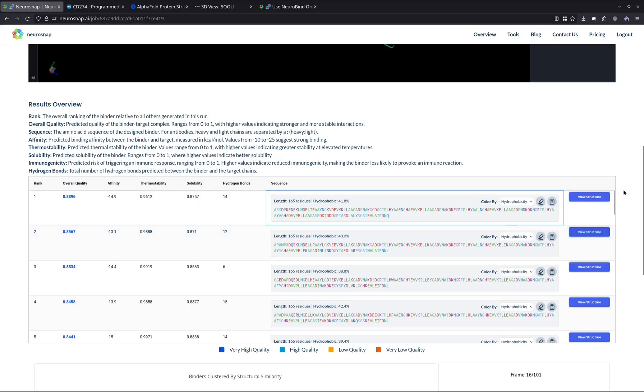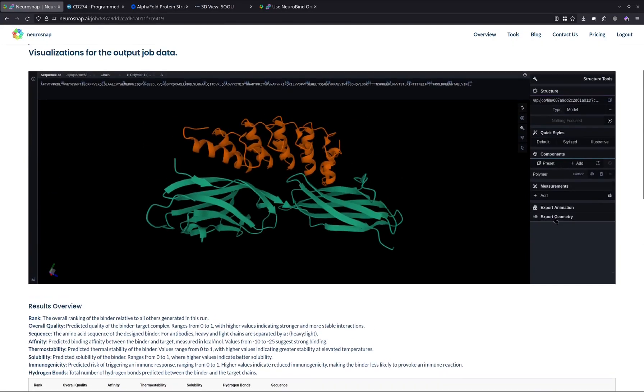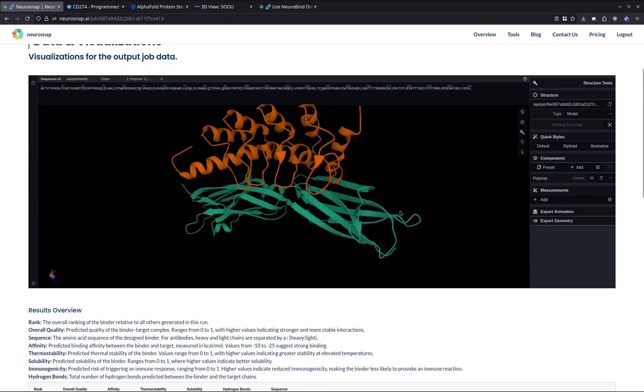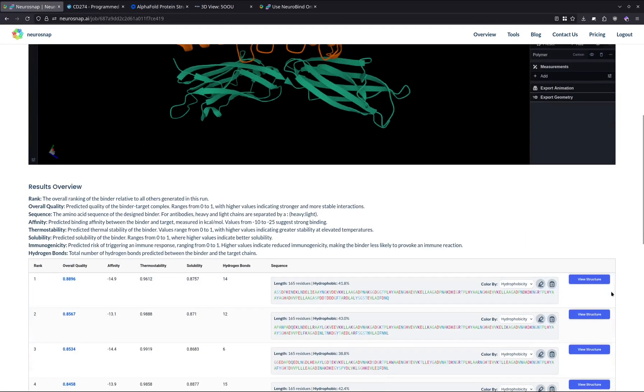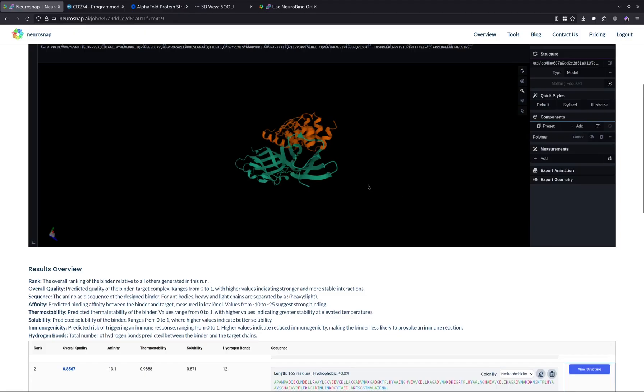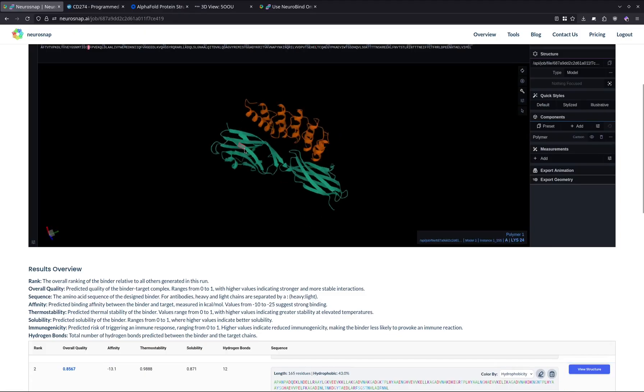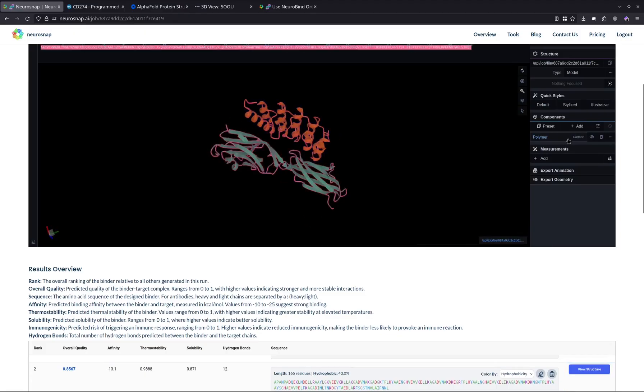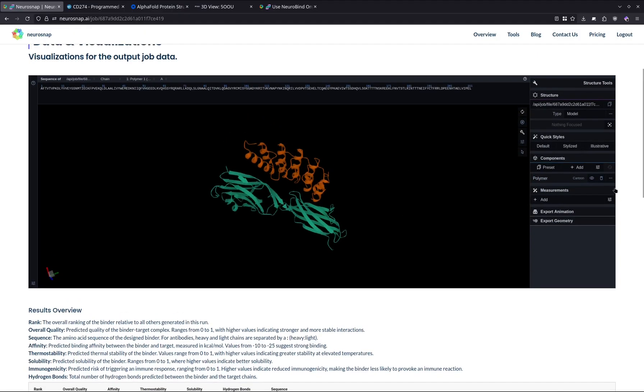Now if you want to switch between the structures, over here is rank one. We can actually switch over to rank two or any of the other candidates as well.